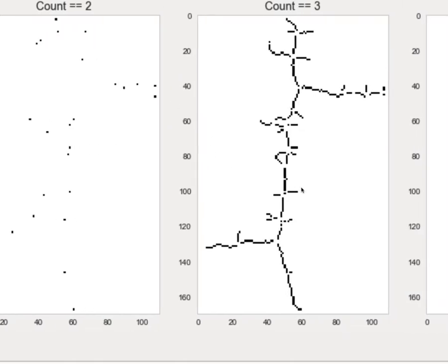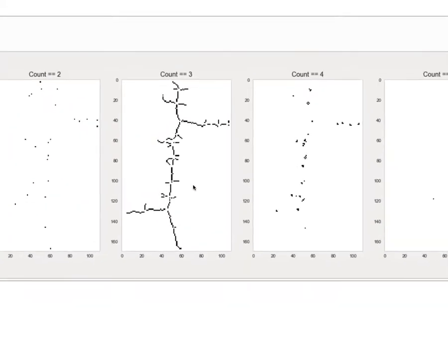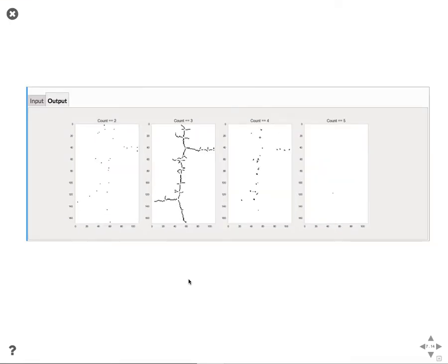But as an efficient starting point, you can calculate the component labeled image very quickly and start to do that analysis. Once we've broken it down into these representations, it becomes very easy. We can now label every junction. We can label every edge or segment and start to analyze it.